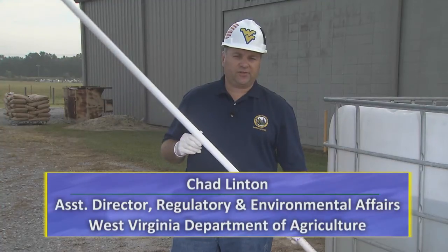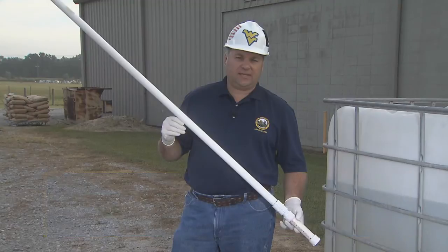I'm Assistant Director of Regulatory and Environmental Affairs. Today, I'll be demonstrating how to use a Texas Tube.